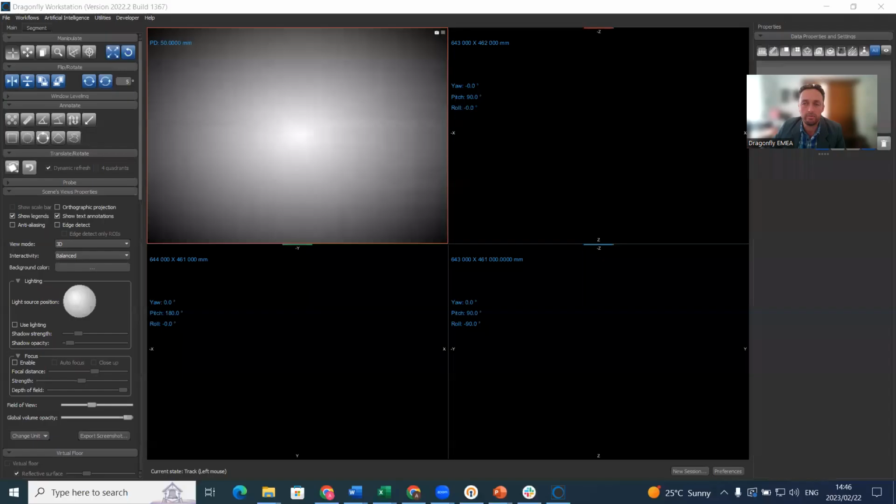So the first three videos in the series were really entry level: first visualizing some data, then segmenting walnut data, very basic segmentation, and then making some analysis of porosity. This fourth video and the fourth step in this tutorial series really is meant for you to take this data and do some practice on segmentation with a fun example of a Lego man. So let me show you that, a Lego figurine.